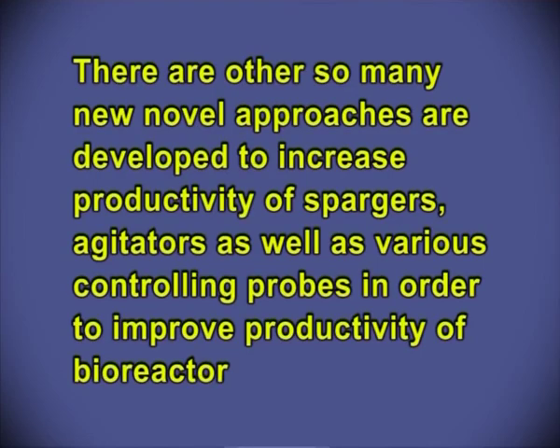There are many other novel approaches developed to increase productivity of spargers, agitators as well as various controlling probes in order to improve productivity of bioreactors. There is no fermenter which can satisfy all the conditions, but availability of disposable fermenters may contribute to increased productivity as well as ease of the fermentation process.